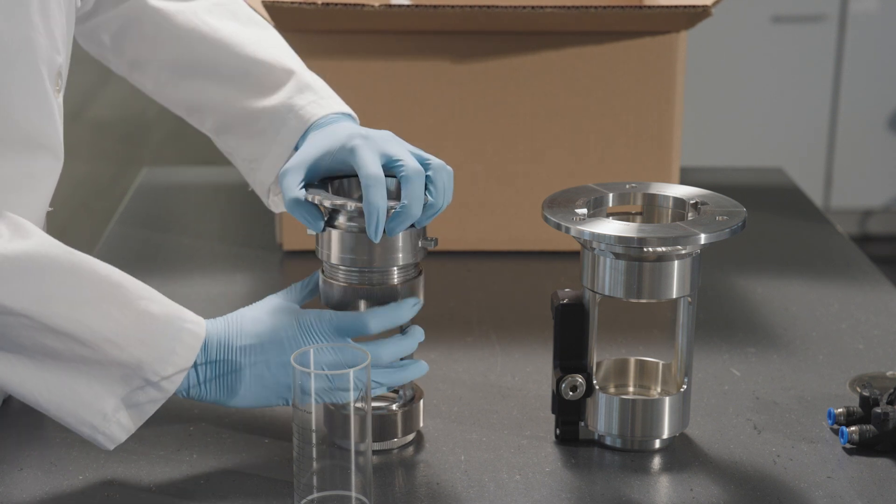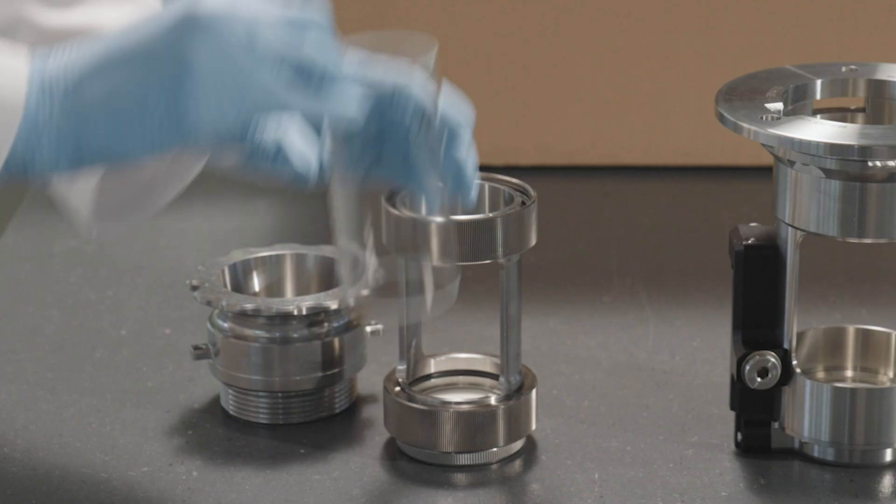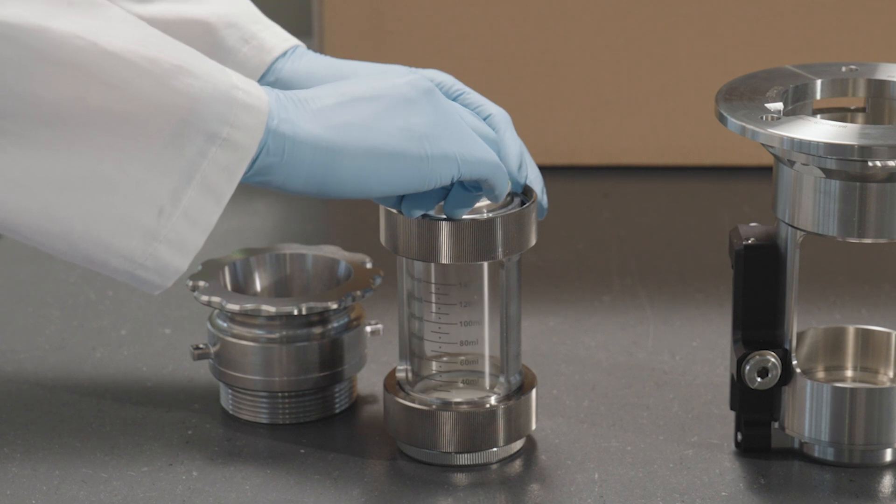Install the glass tube by removing the funnel piece. Insert the glass tube and ensure sufficient scale visibility.